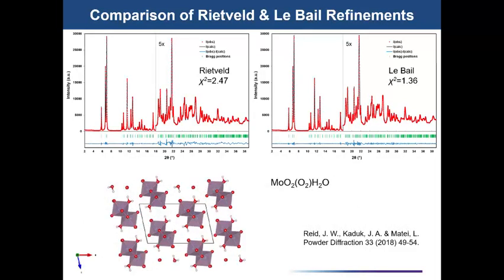In this specific case, this structure was confirmed with comparison to the density functional theory optimized structure, so we can be reasonably confident that the crystal structure is correct. And I'm going to talk a little bit more about DFT towards the end here.